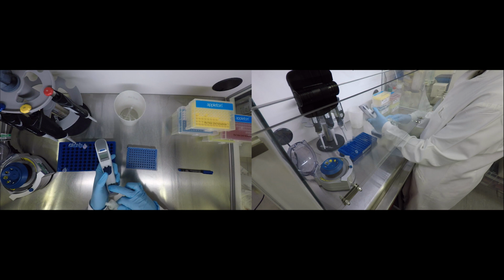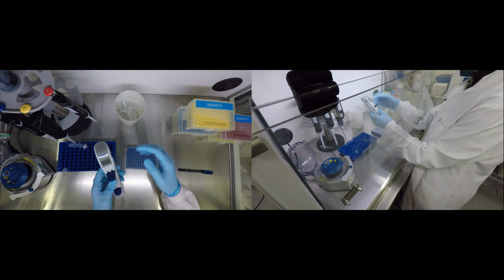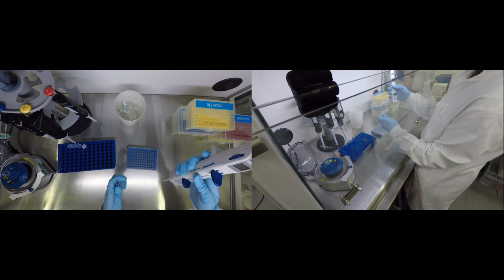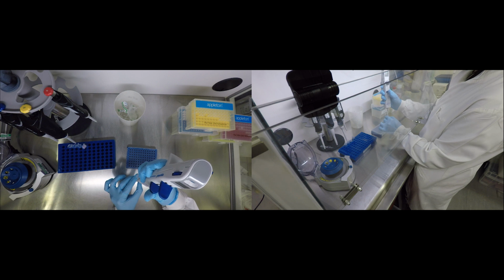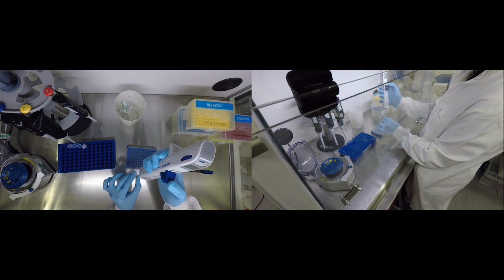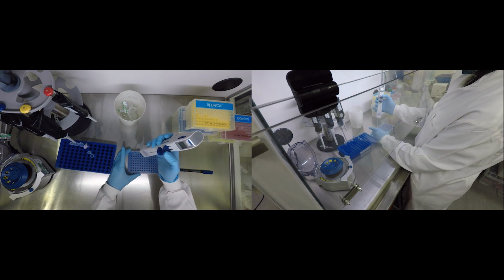Once all the reagents are in, meaning your primers, your probe, your water, and your polymerase mix, flick the tube, spin it down, and prepare the repeat pipetter to aliquot 5 microliters of master mix into each well. I'm using the repeat pipetter M4 by Eppendorf for speed and convenience, but you can use any pipette.